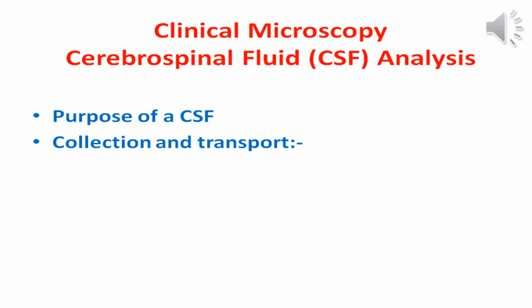Also, the first step in microbiology is to culture the sample in the primary plates, as you remember: blood agar media, chocolate agar media, and MacConkey agar media. After culturing, you can perform the Gram stain, the acid fast stain, or the India ink stain, because as you remember, CSF is sterile. There is no normal flora present in the sample.